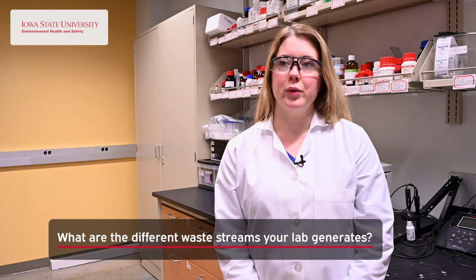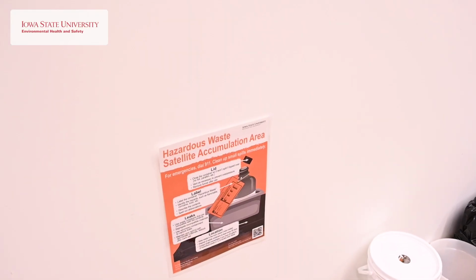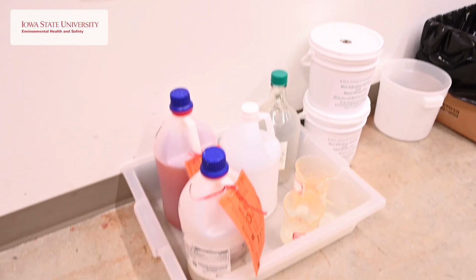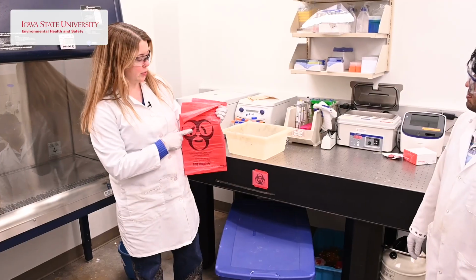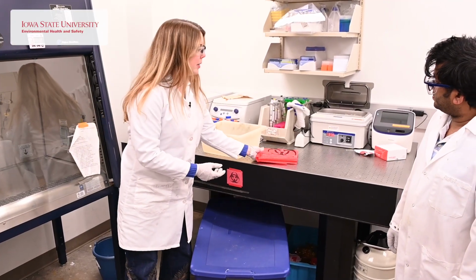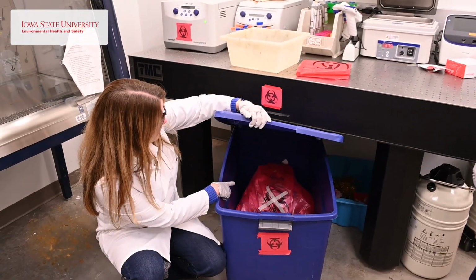Since my lab works a lot with microfluidic devices that need to be ultra clean, we use a lot of solvents for cleaning those surfaces, as well as strong acids and bases to make sure that we are able to decontaminate surfaces. In addition to that, we do biological research where we work sometimes with clinical samples as well as human cell lines. And so we create biohazardous waste that you would expect to find in a BSL-2 facility.